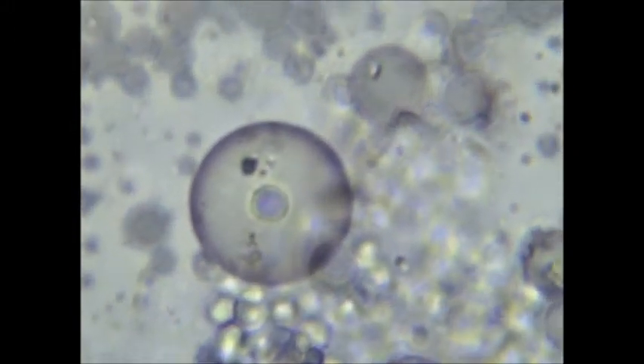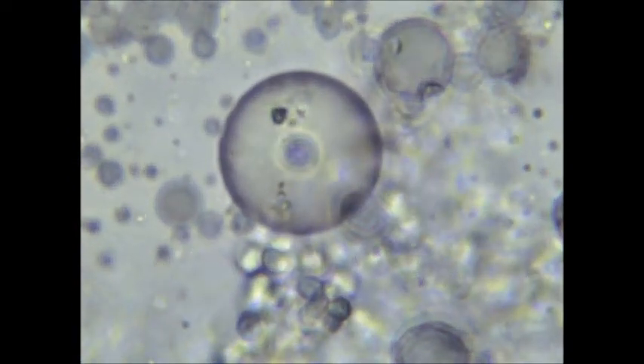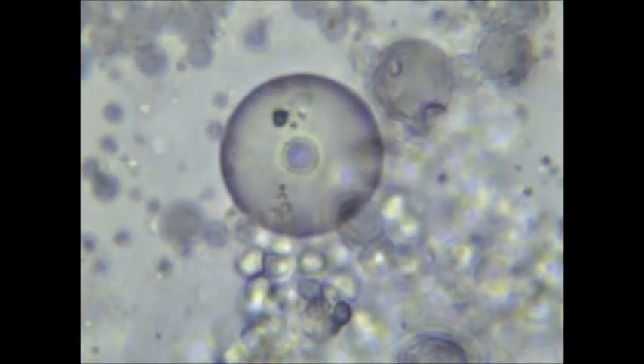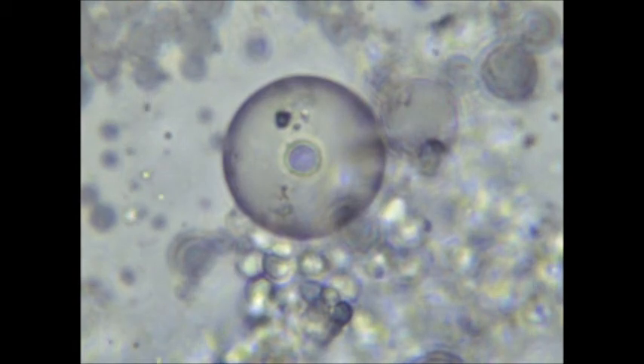Let me explain my methodology here. First I took a solution of fatty acid vesicles in distilled water. I added sodium bicarbonate and adjusted the pH to around 8. Then I took another solution of RNA to which I added hematoxylin stain.